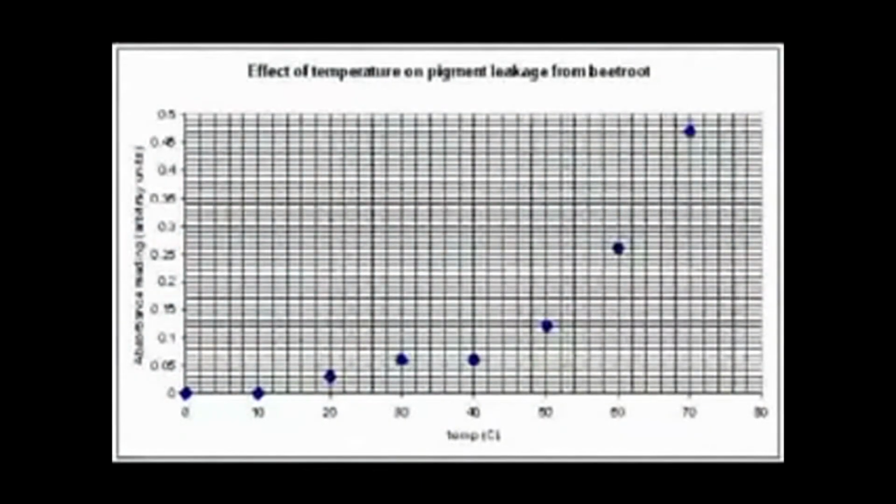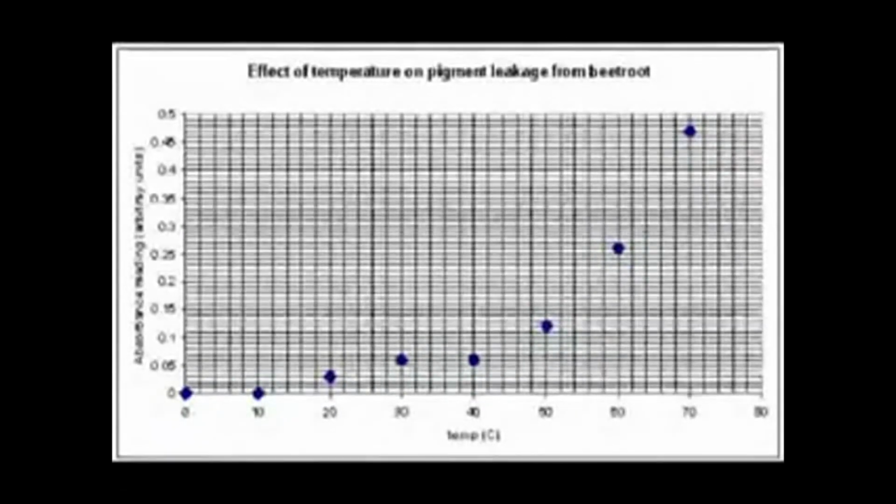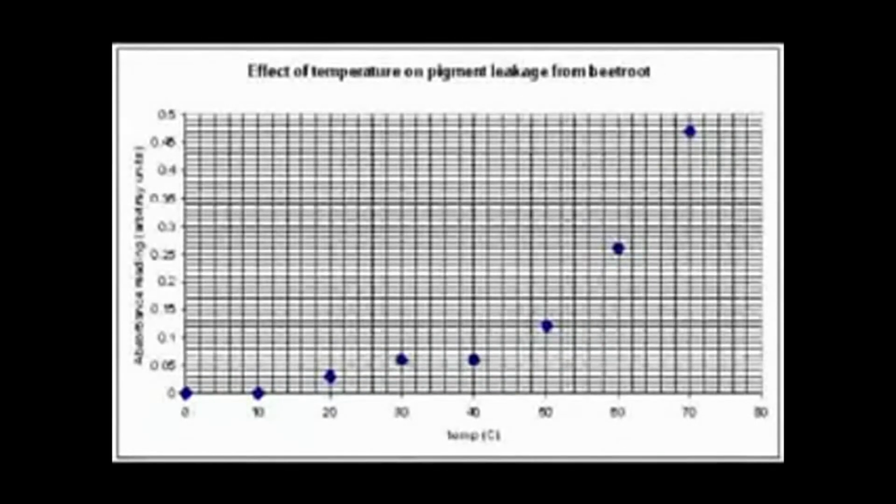If we plot a graph of the data, you can see that there's very little effect of temperature until we get to about 40 or 50 degrees centigrade, and then there's a fairly sudden rise in the amount of pigment leaking out. Notice that this does not imply a conclusion that as the temperature rises the amount of pigment leaks out, or at least there's more to it than that. The crucial thing to see in this experiment is the relatively sudden leakage of pigment at around about 50 to 60 degrees centigrade. This tells us something about membrane structure.